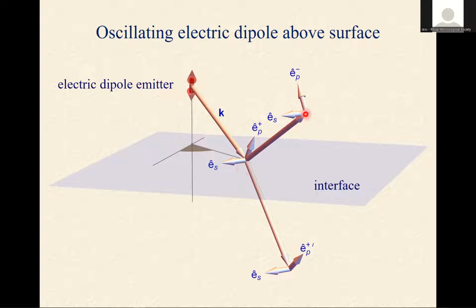And this partially reflected light, this is now the fun part, can back react on the emitter itself. Although it's a single photon emitter, this photon can somehow be virtually split and back react on your emitter, which can modulate its own emission. Now, this is really quantum optics: single photon self-interference, or single emitter self-interference. I will not go into the mathematical details here. This was also very well worked out in the last century by Chance, Prock and Silbey, and other people, Lukosz and Kuhn, and Drexhage.